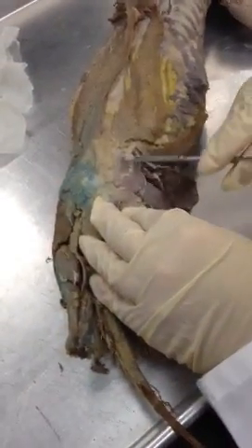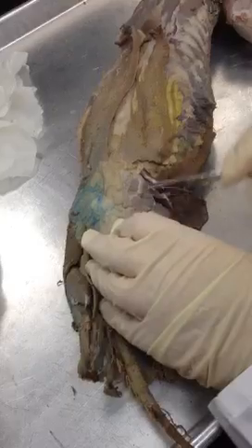On the back, the bacon muscle — cutaneous maximus. Right in here, the little butt — gluteus maximus. Not very maximus at all on this mink.